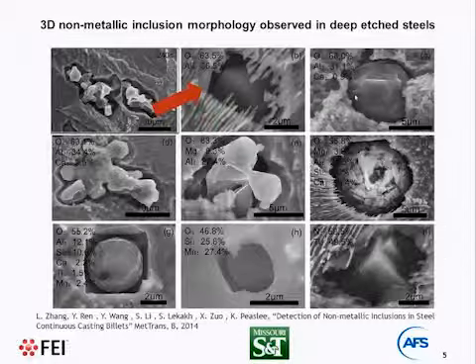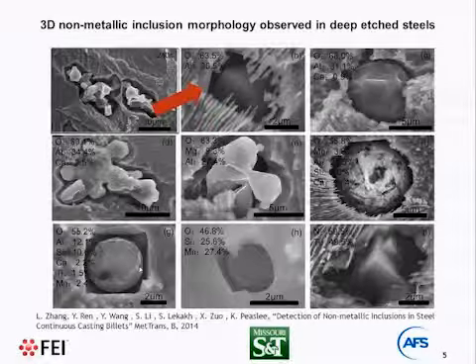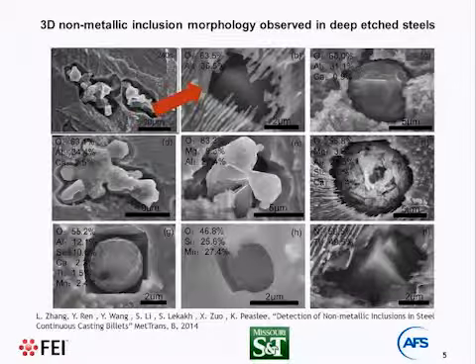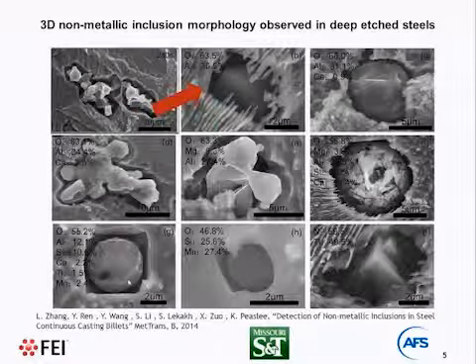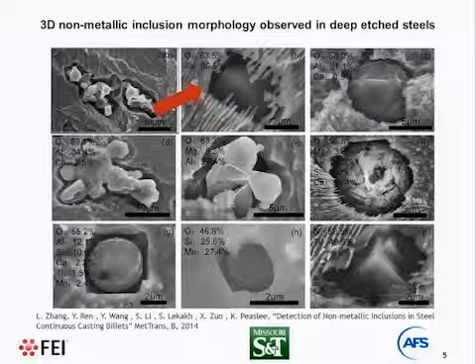Some inclusions are like calcium modified. It could be a complex inclusion. Most importantly, with calcium modification, solid inclusions transform to liquid inclusions during processing. A liquid inclusion gallery is interesting, maybe for academia, for a professor of metallurgy.